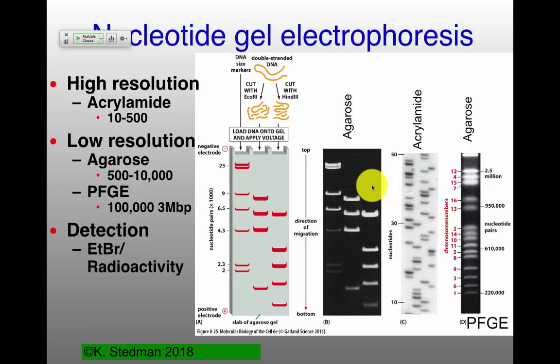That's great if you've got big pieces of DNA. If you've got really short pieces of DNA like this, classically what's always been used is radioactivity, because radioactivity you can detect just by putting a piece of photographic film on top of your gel in this case, and then it will become exposed due to the radioactivity. And that's what's used for these smaller ones here.